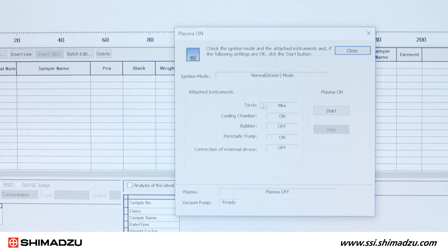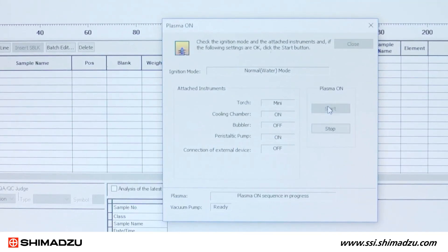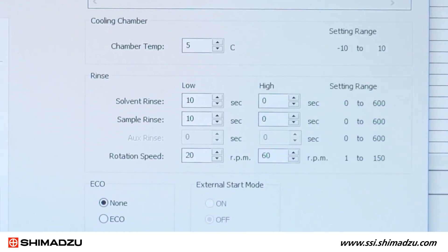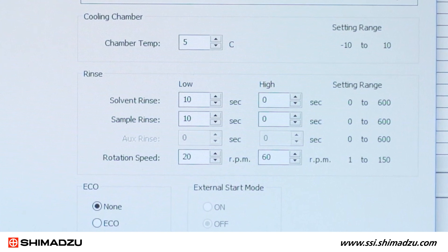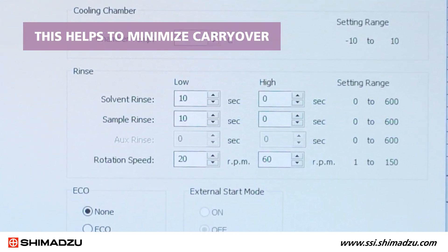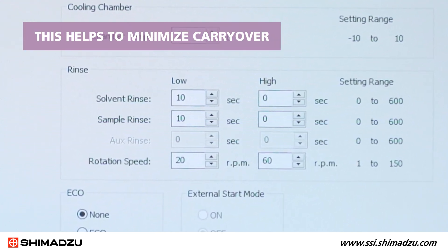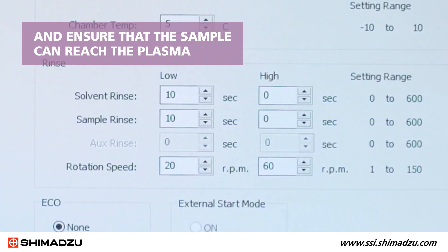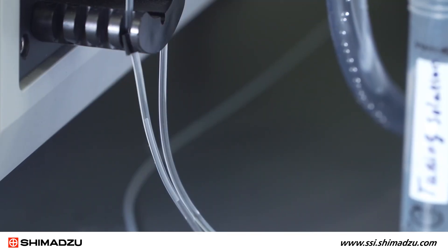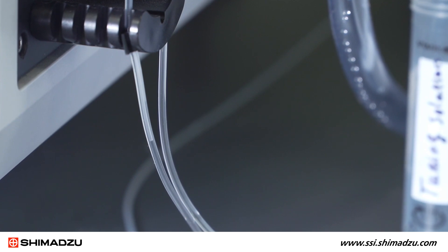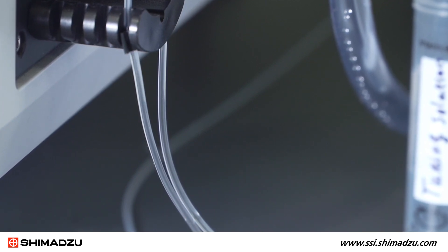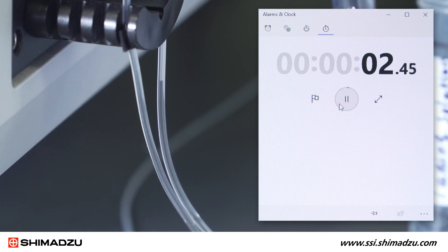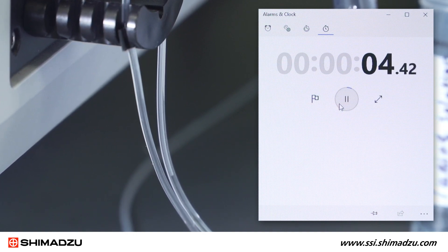If a new probe has been installed or the length of the tubing has been changed, then the times of solvent rinse and sample rinse at high rotation speed should be adjusted before acquiring data. This helps to minimize carryover and ensure that the sample can reach the plasma. Solvent and sample rinse times can be determined by manually generating a bubble in the sample tubing and using a stopwatch to measure the time it takes to move from the auto-sampler probe to the nebulizer.